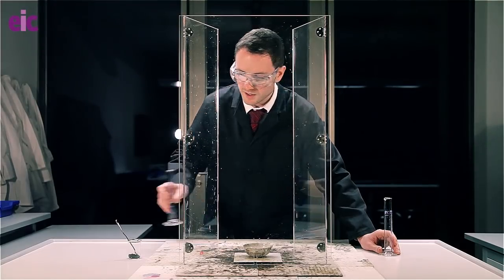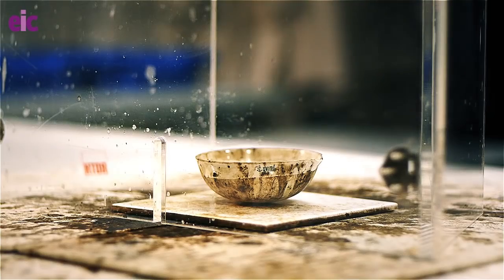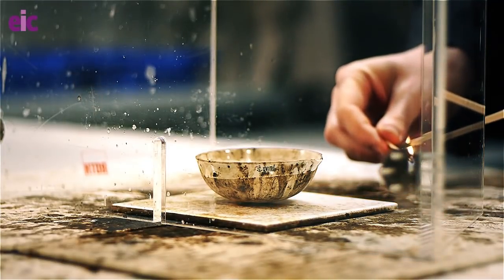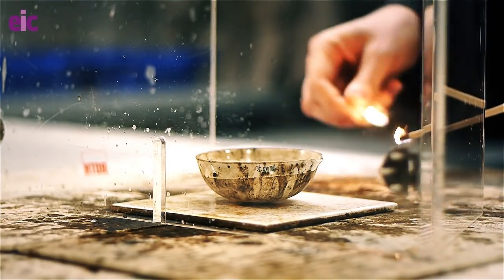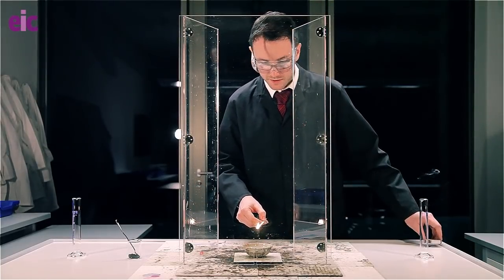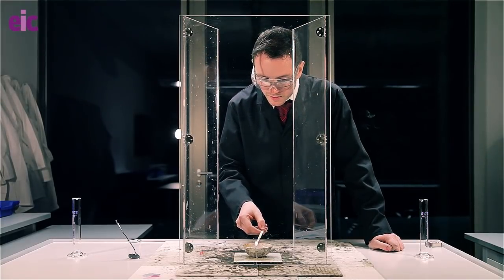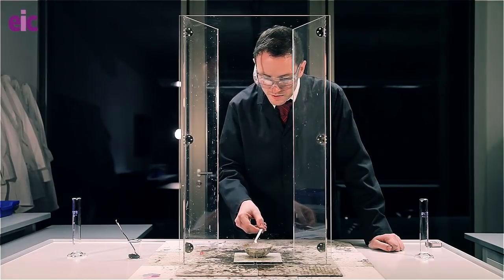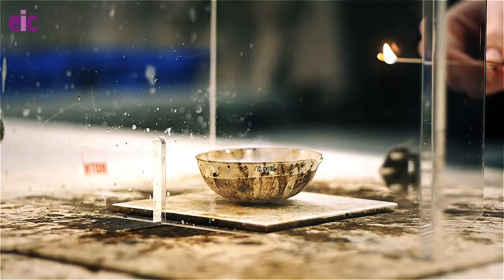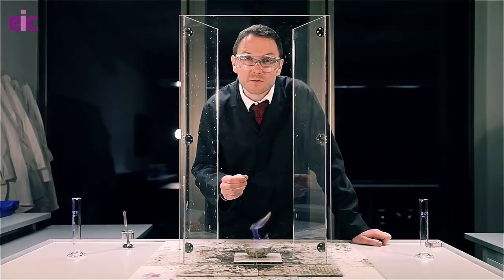You're going to want to now stand back and light this with a splint. The splint is going to give you a little bit of extra distance between yourself and the flame, which can actually be hard to see — it's almost invisible. But I can see that this is lit in this case. So our flame's lit now, and we're ready to start the reaction.